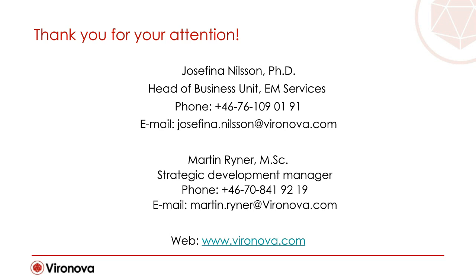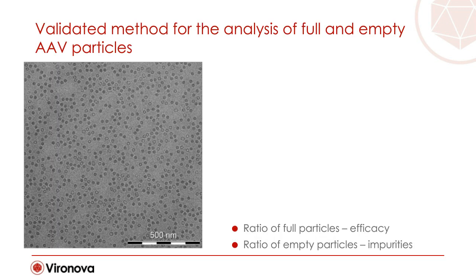Okay, next question. What about not completely full or not completely empty particles? Can your software distinguish them from fully full or fully empty particles? It again depends on the size of the genome. I know that we have had one client where we were able to distinguish between two sizes of genome, and they were both characterized as filled.